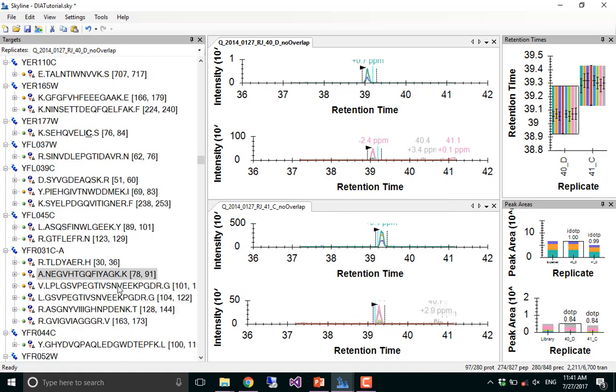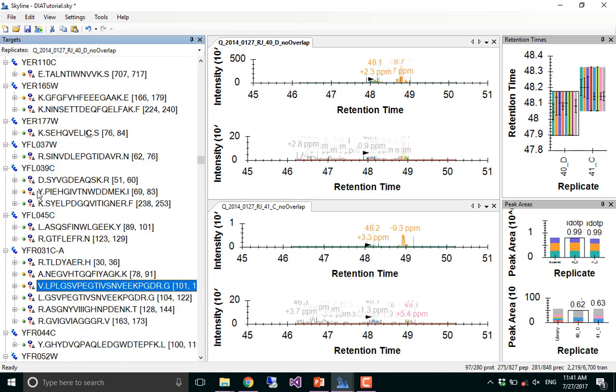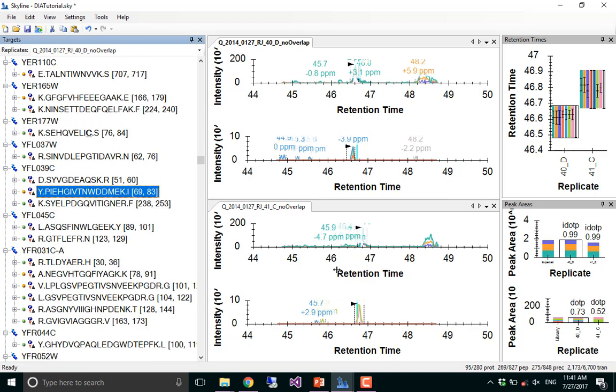And sometimes you might be able to find suspect detections where the blue line might be further away from the peptide than you think. If you're seeing that happen, one thing to keep in mind is if it's a peptide with a very low retention time, sometimes that region's more variable in terms of the retention time, so your expectation might be that it's a little further away. But generally, you want it to be pretty close.